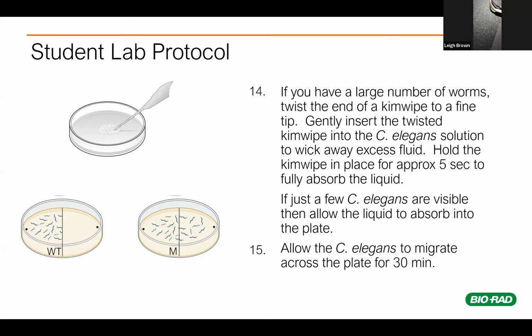One caveat, though, because I have run into this in one course before: if you are in a room where you've got bright light, you want to at least orient the plates so they are the same distance from the bright light. These worms are not hanging out on the surface of the soil. Usually they are down below, and they're not a big fan of super bright light. So if you've got a super bright light around, you might get a false positive or false negative, because they're trying to avoid bright sunshine. So just be aware of that.